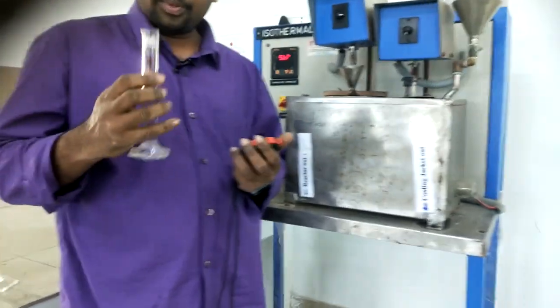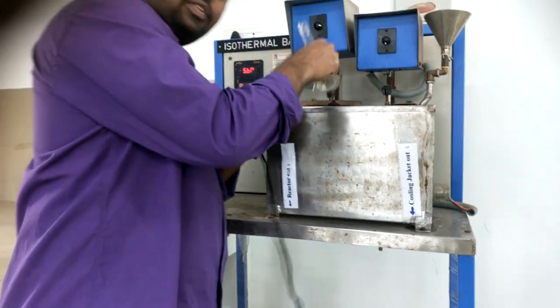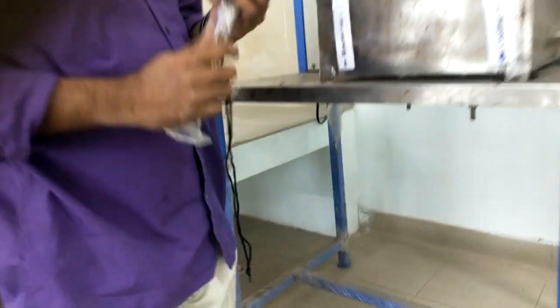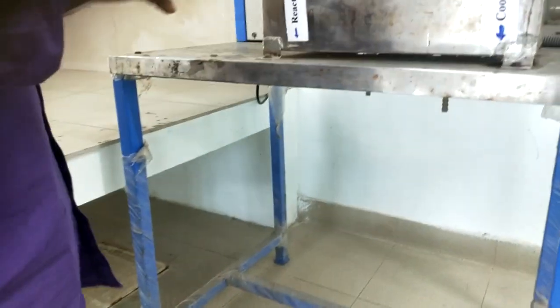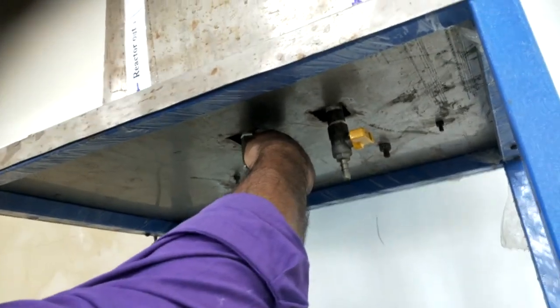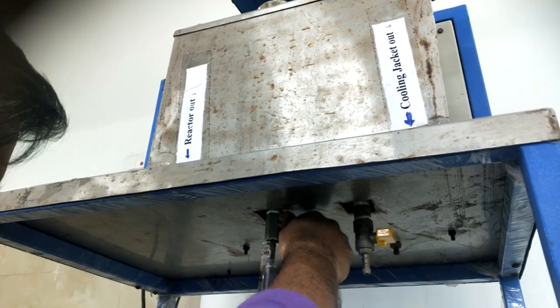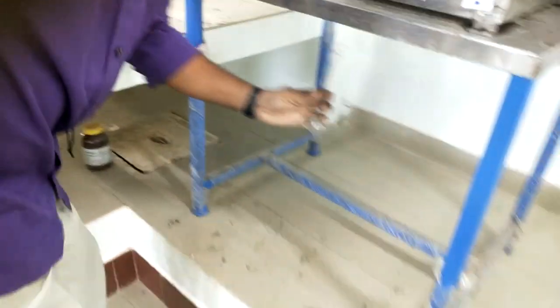I am ready with the stopwatch and measuring jar to collect a 10 ml sample. Into the reactor, it is difficult to put the pipette and take it out. So we will collect the 10 ml sample from the bottom. At 1 minute, we will collect 10 ml of sample from the system. So it's filling. Then the procedure is the same.